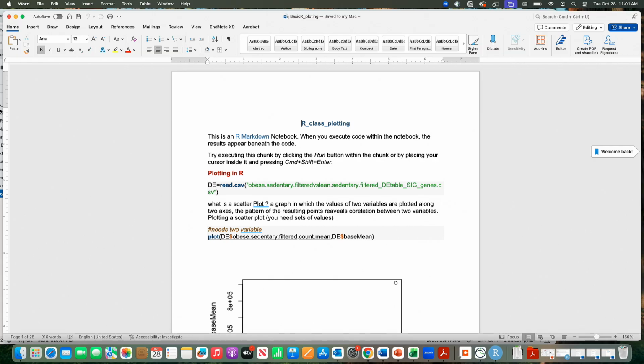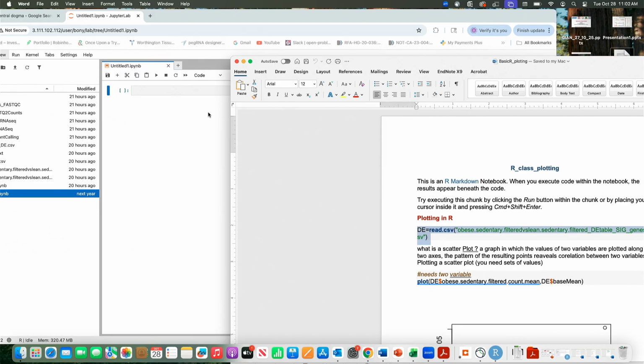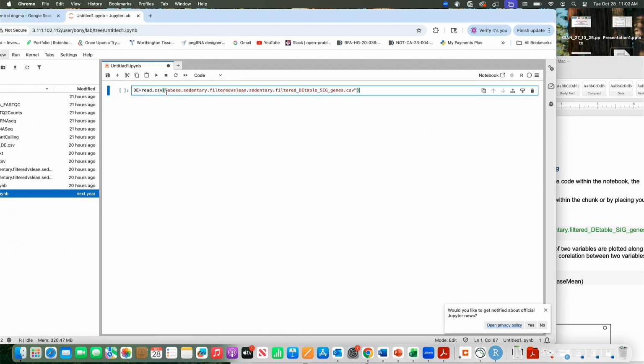Let us first start with copying this, and I will explain what it means, and then we will go to the next. Just copy and paste this line of code into your code, and just leave it, don't do anything at this point.